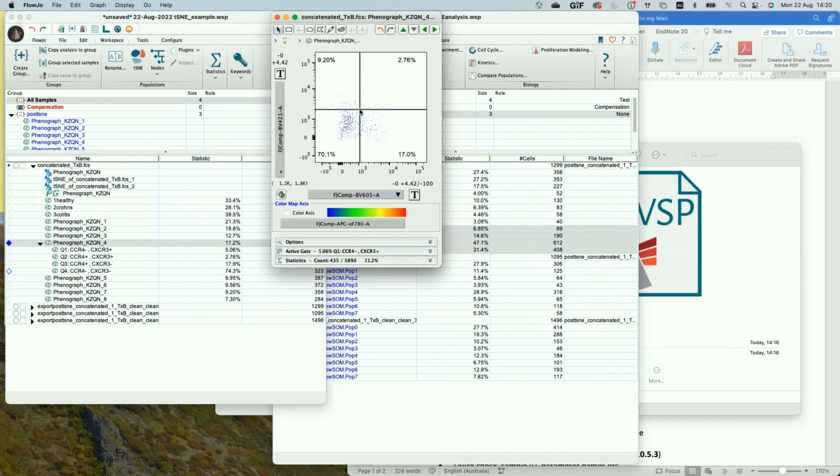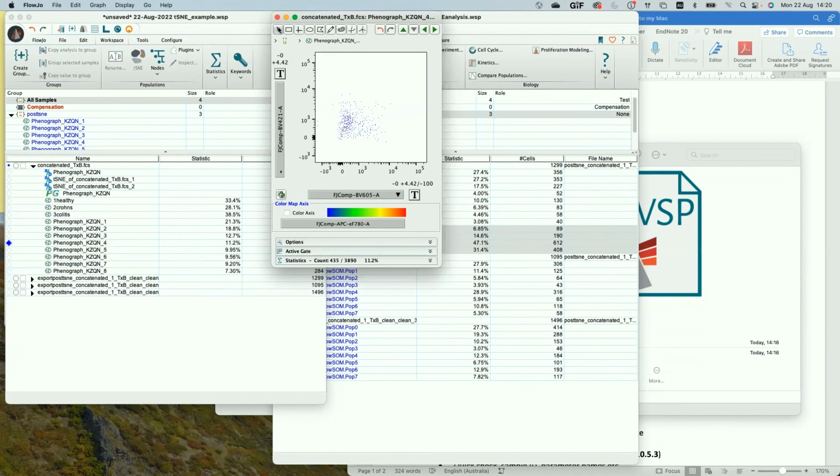You define a new gating strategy for it, but then you still need to go back to all of your individual sample files and apply this as a new gating strategy to get your percentages, to then put into a plot, to then do the statistical analysis, including all the variance across my entire cohort: is this now a statistically significant difference in the expression?